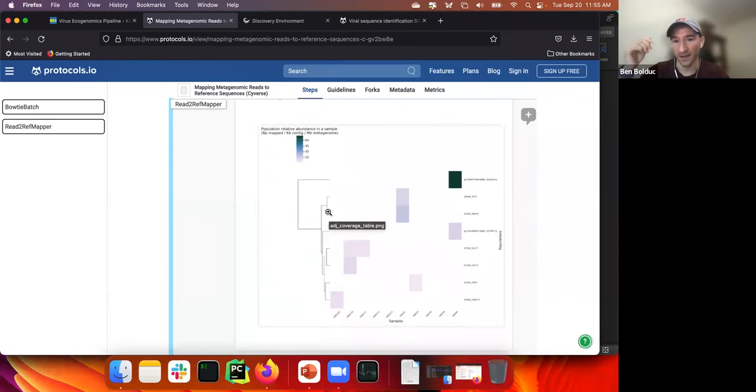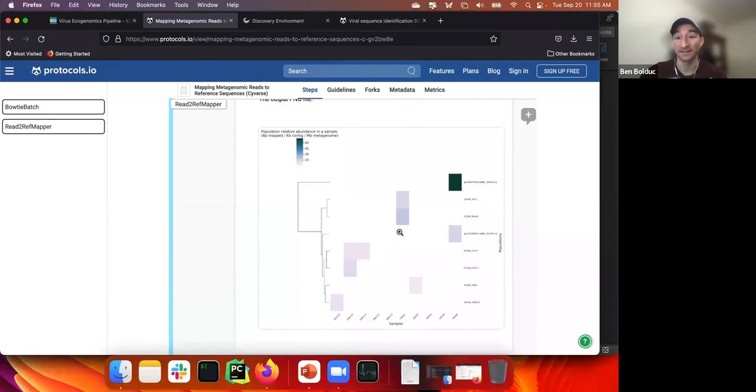And then if you run that, you'll get this kind of heat map. Now, this is a far cry from what you might see in Science or Nature, but this is only an example, kind of like a gross overview of what the data set looks like.